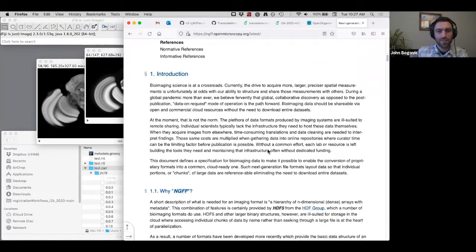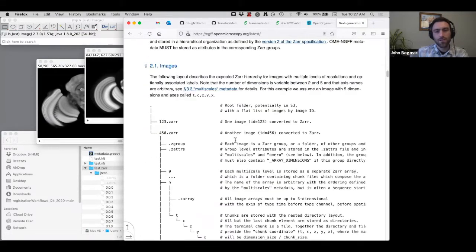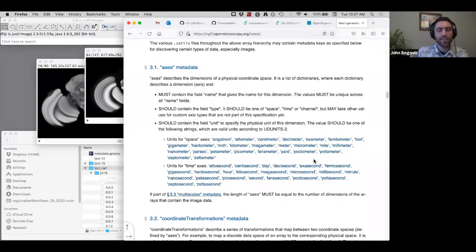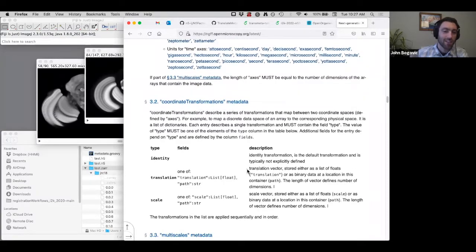And I guess this is what I would recommend. This has support for multi-scale metadata and pixel spacing and many other things. So I think this covers a lot of what most people need. And if in looking at this, you find that you don't need much more than what is here, I would encourage people to use this because it exists and it will become more widespread, and more widespread means the plugins that I'm showing today will soon support this as well.